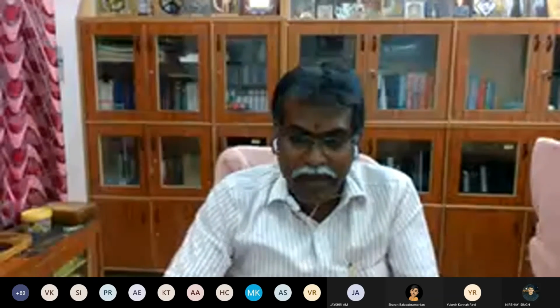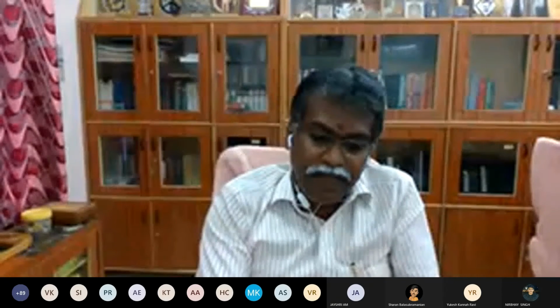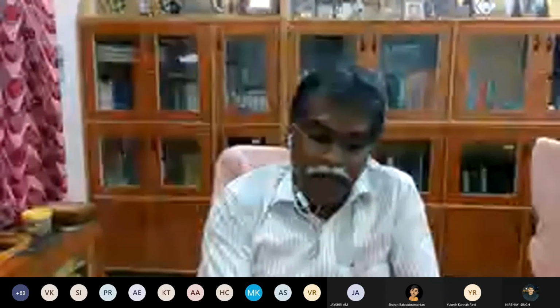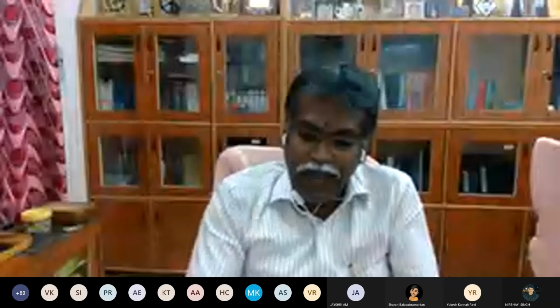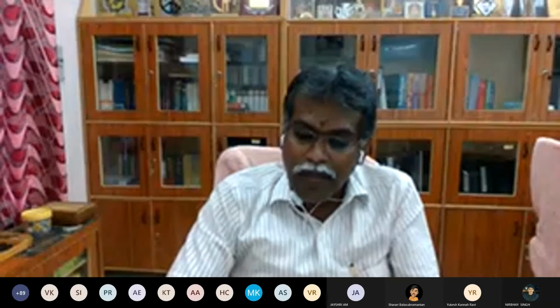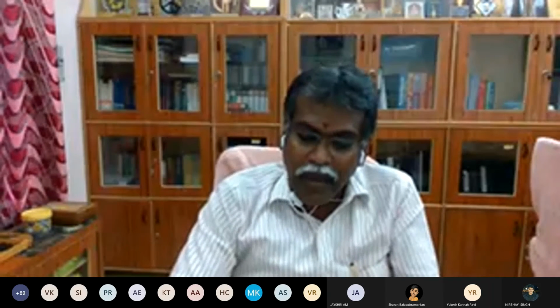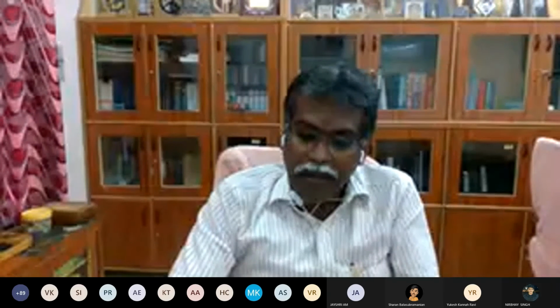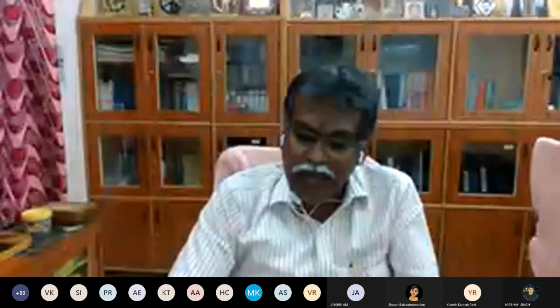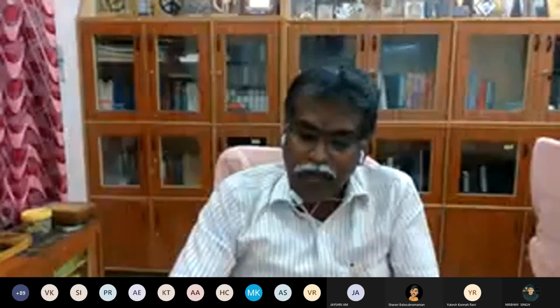Okay, yeah. And you can also measure optimum coagulant dosage by turbidity measurement. That's also something you would have seen in the last semester. So what do you do now? You can add coagulants into the water. You can measure the remaining turbidity. You can also measure turbidity removal efficiency. So this could be your optimum coagulant dosage.